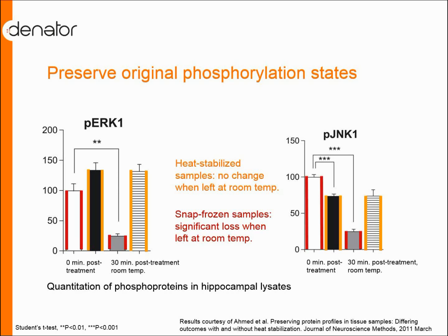The rationale for this is primarily in a pathology setting where it's difficult, where the sampling and then the analysis generally takes between 30 minutes up to an hour in standard cases.